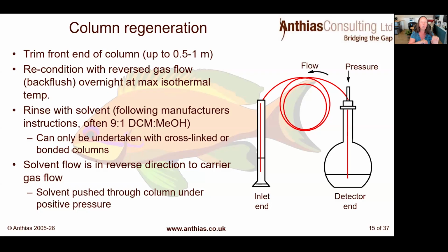But of course, you've got to make sure that it's definitely the column before you do any of this. Now, if you have a really badly damaged column and you think, right, I'm going to have to replace it, you can try one more thing to see if that will help. And that's by rinsing the column with a solvent. Some of the manufacturers do offer this so that you can do it.